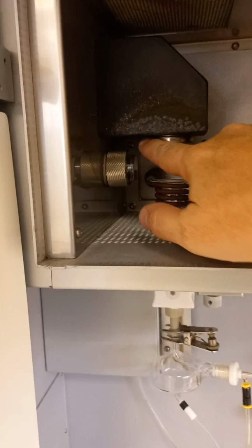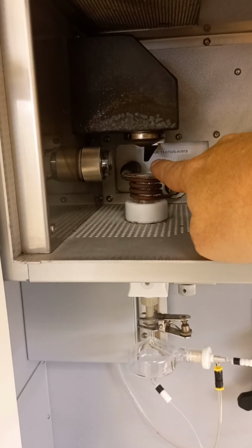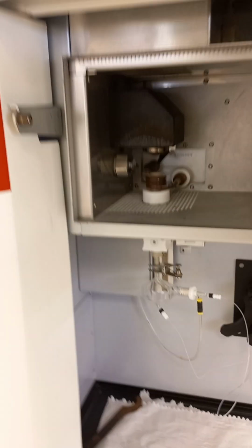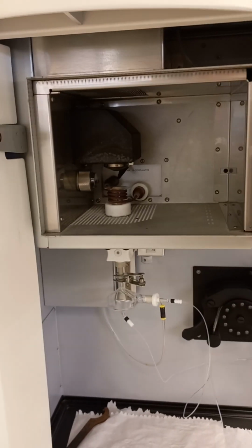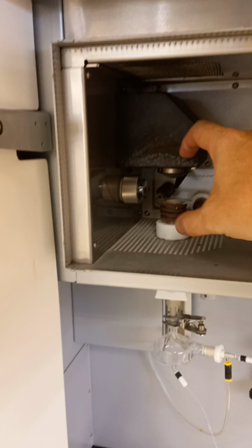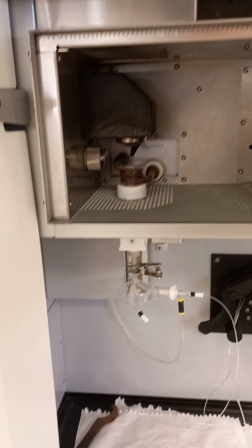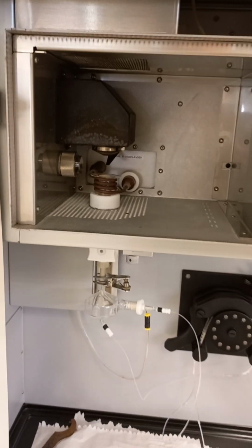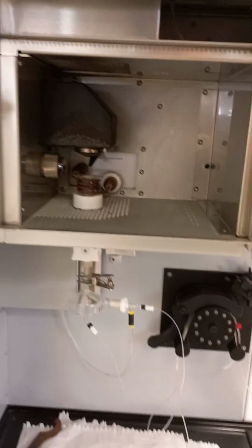And this part, as in ICP-OES, is the cone. This is an axial view cone, and this is a radial view window. So this instrument is so-called dual view. It may read the signal from the top of the plasma, and see through all the way of the plasma, and see all the species that we have. This way we get a stronger signal, we improve our sensitivity and the intensity of our peaks, but we get all possible interferences, easily ionized elements, and so on and so forth.